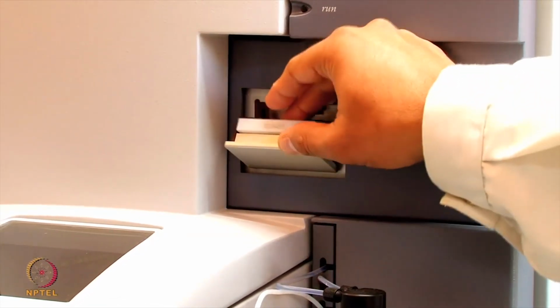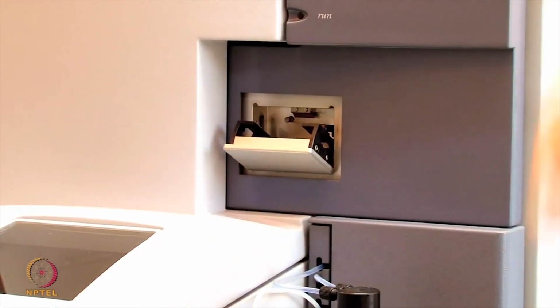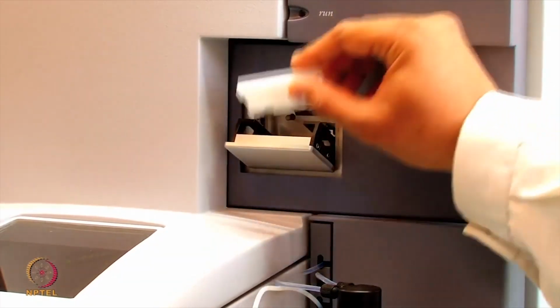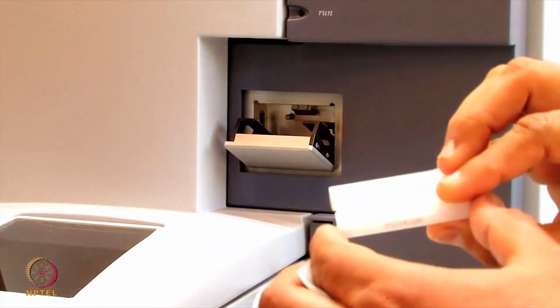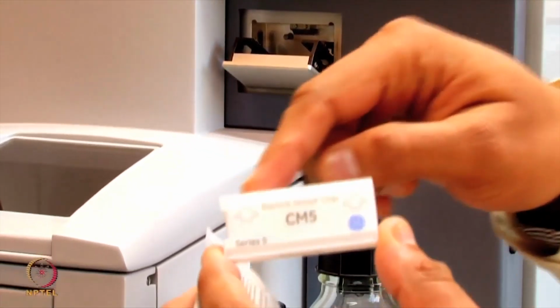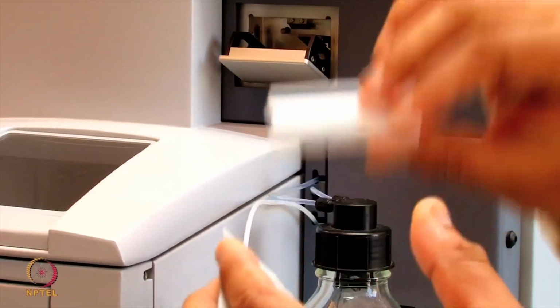So now the old chip will be removed and we will insert a new Biacore chip CM5 here, and the orientation of the chip is shown on the chip in arrows.